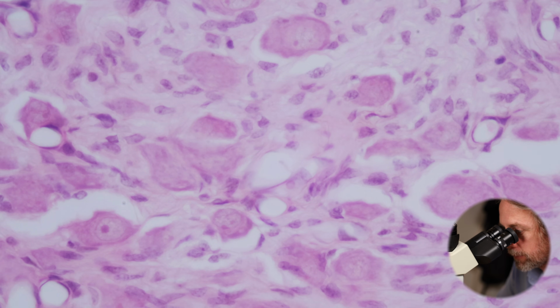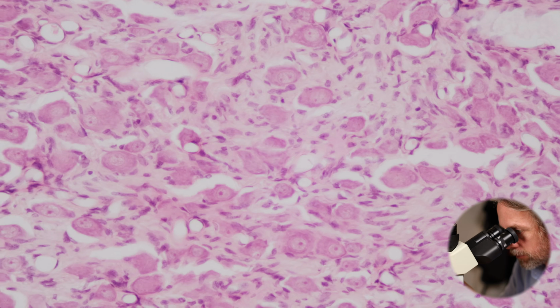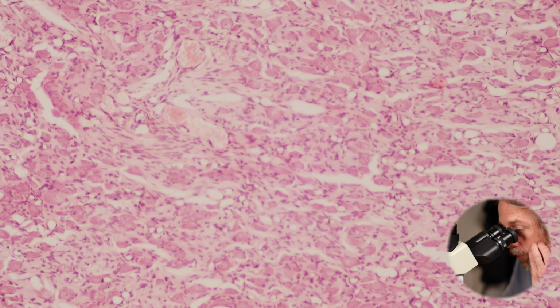All right. So we've looked at the neuron cell bodies, and then we've seen peripheral nerves, which are mostly axons of neurons from all sorts of places. Maybe their cell bodies are in the spinal cord, maybe their cell bodies are from a ganglion, maybe their cell bodies are from a nucleus in the central nervous system.